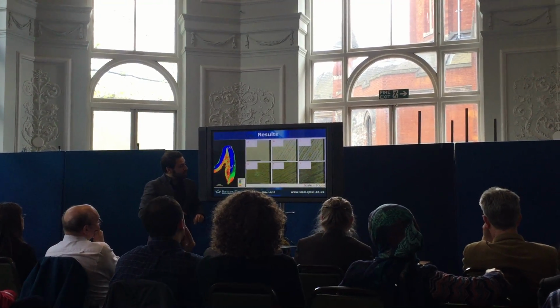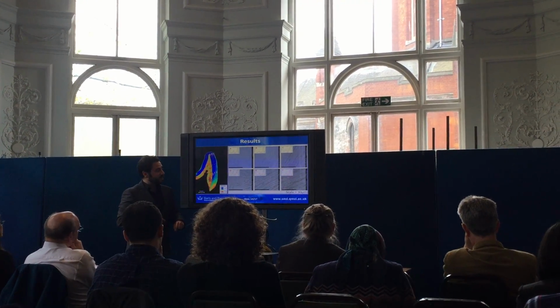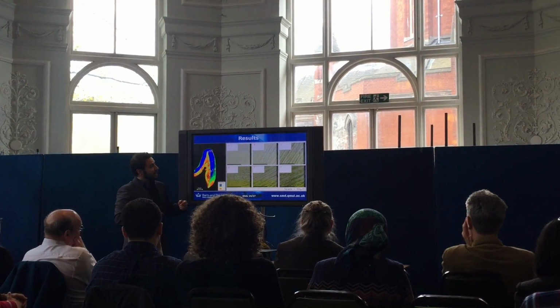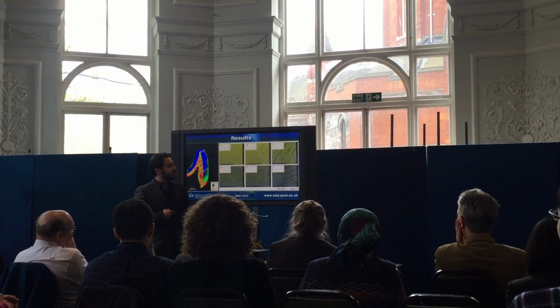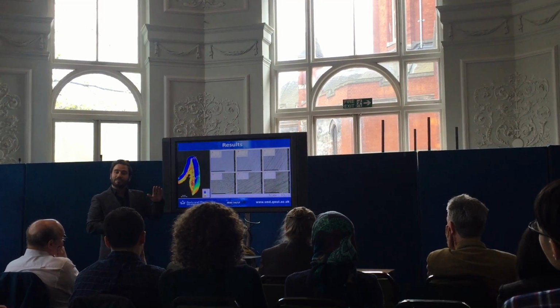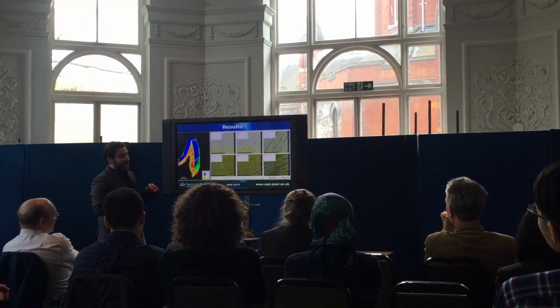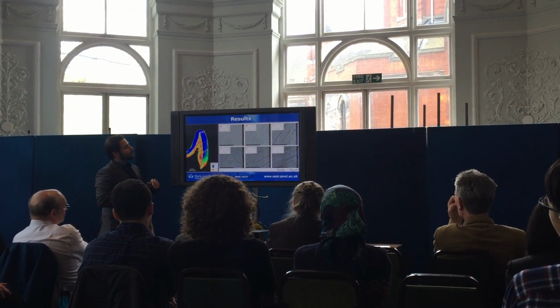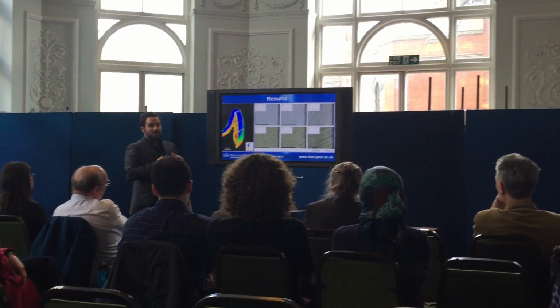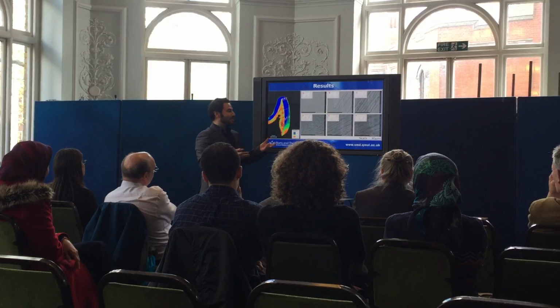Look at F. F has prism boundaries and also has dark areas between the crystals themselves within the prism. And then when we go to B, which is more mineralized, more developed, I'm not sure if the back can see this, but we don't have these spaces between crystallites. We only have the spaces between the prisms, the prism boundaries. While at A, which is the fully developed, we don't even have the prism boundaries. So we can assume that the spaces between the crystallites mineralize first, followed by the prism boundaries, and so on.